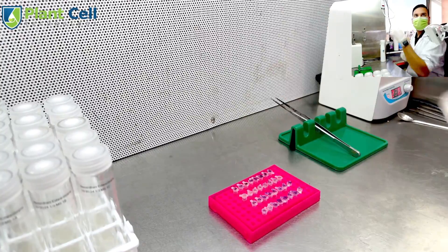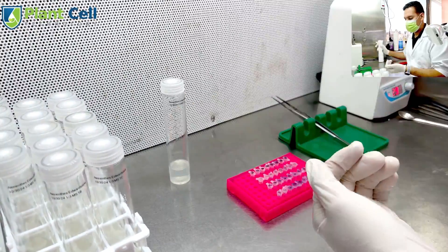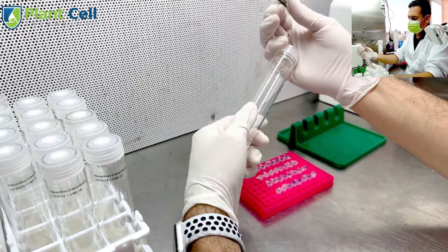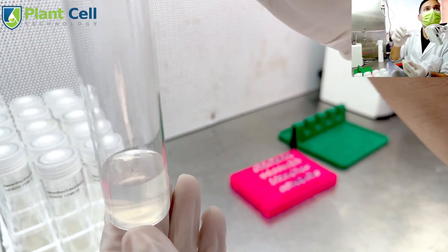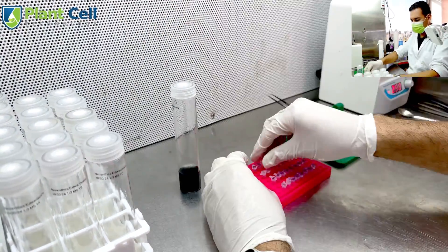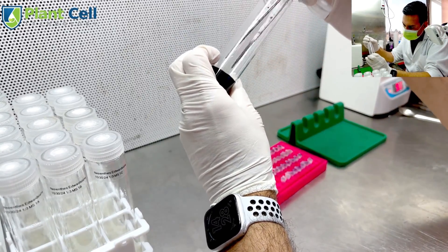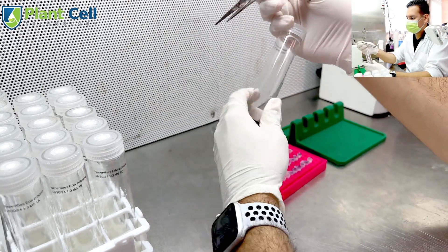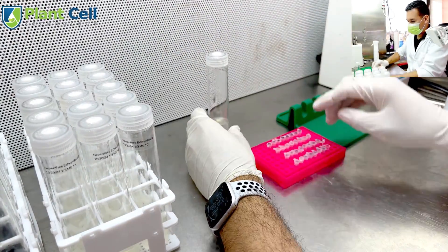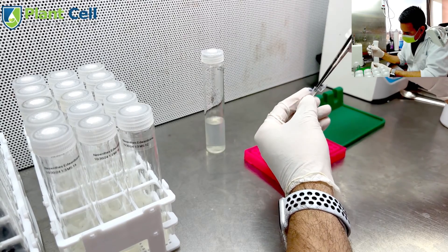After rinsing, it's time to move the seeds into media. I have two sub-experiments: media with charcoal and media without charcoal — everything else is the same. The media is a one-third MS formulation, because Nepenthes doesn't like a lot of nutrients. It is hormone-free, since seeds don't actually need hormones; hormones are added later for multiplication once the plants have grown a bit. All I do now is add media to every labeled test tube.